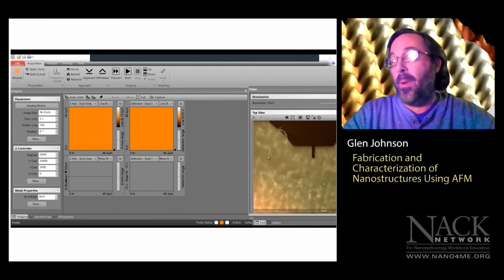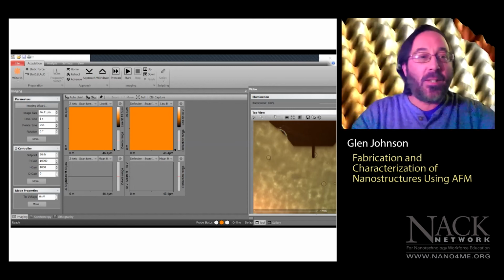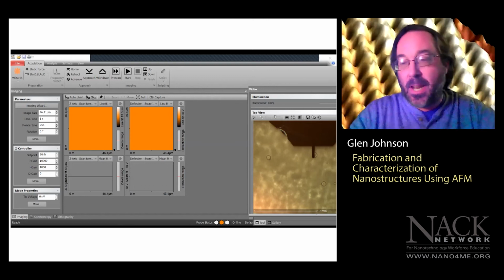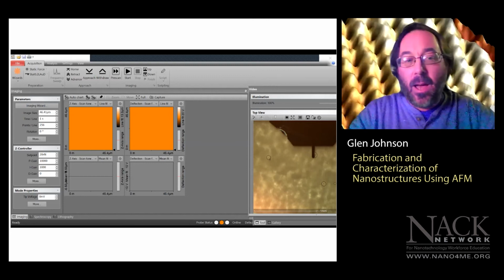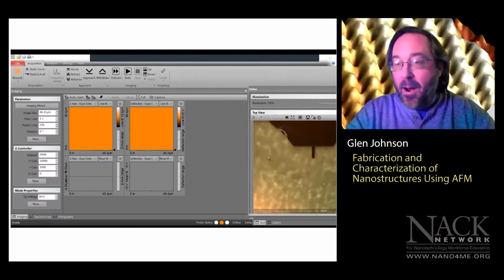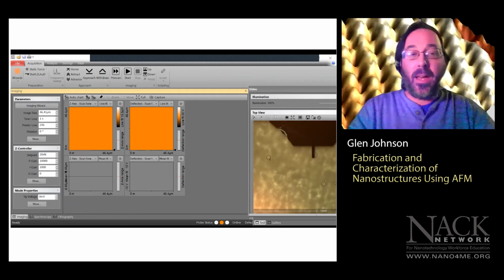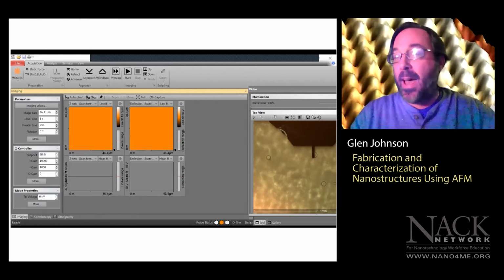A contact probe is a lot longer, so it would come out here somewhere. But then I went through the same process. I raised my set point. You can see over here, it's currently set at 20. I haven't changed anything yet. I would have turned this up to say 40 again, scanned an area of maybe 10 microns, and then I would be able to image that area.